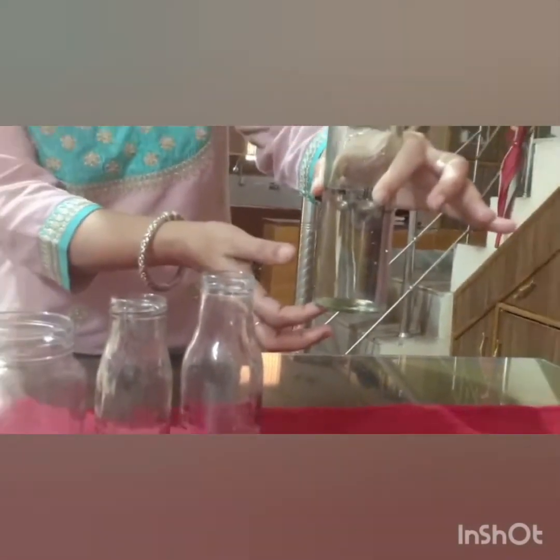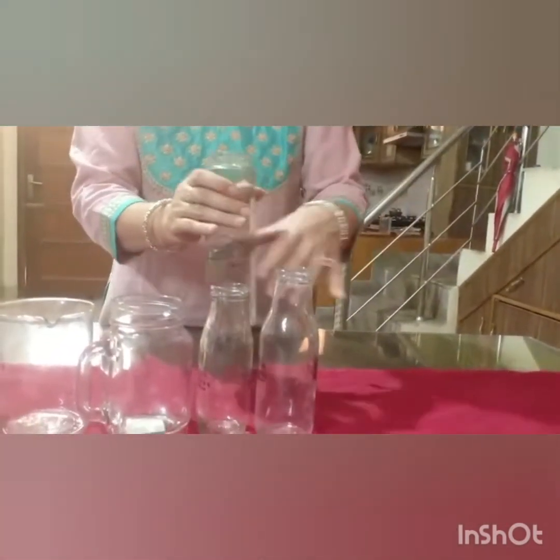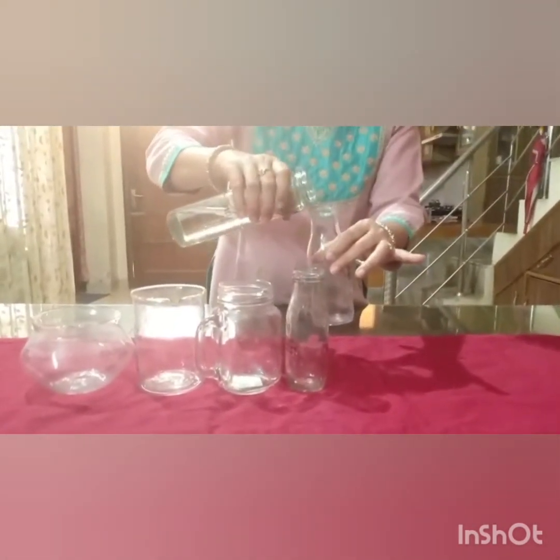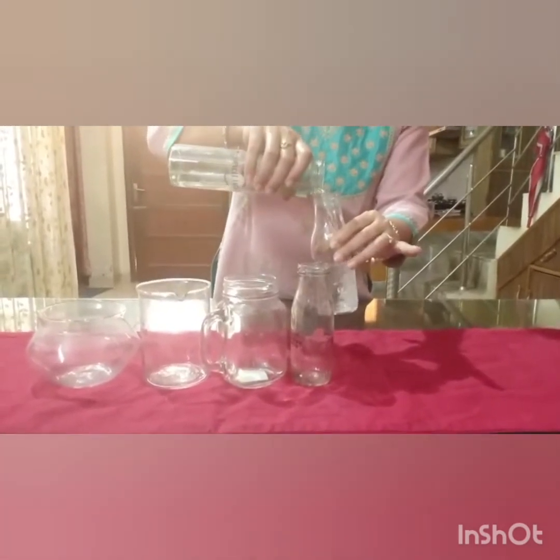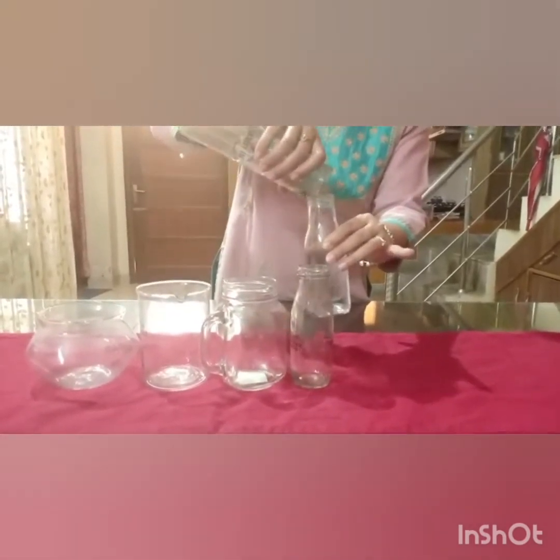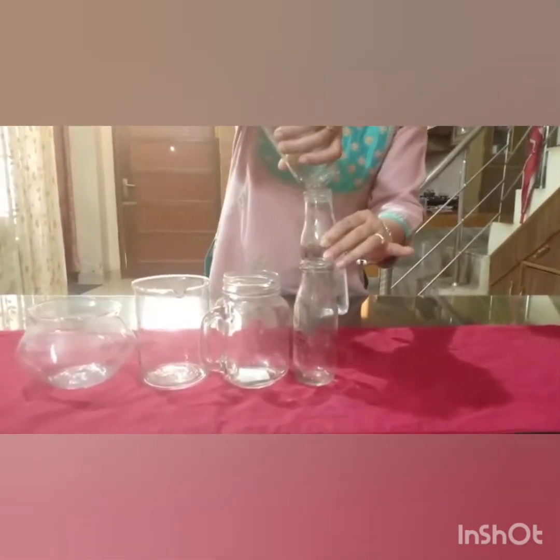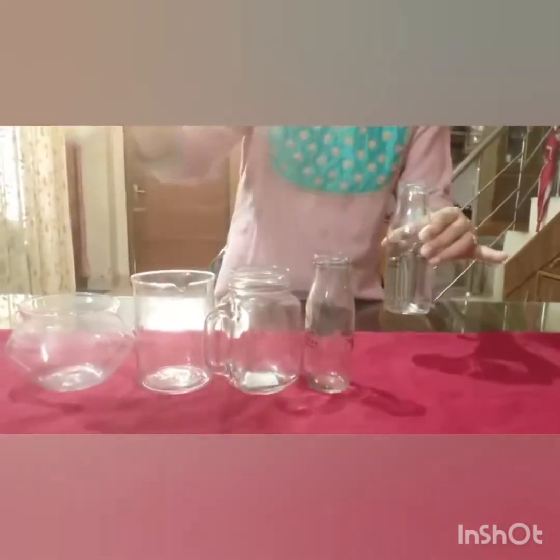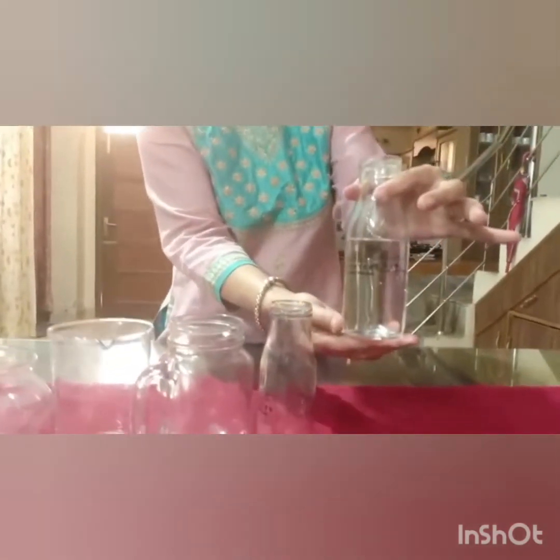So what is the shape of water here? So you can see a different shape. Now I'll pour this into a new jar. So this is my second jar in which I'll pour the liquid. If the jar or the container has a narrow neck, then we use a funnel to pour so that the liquid does not spill. So see children, this is the new shape of water.